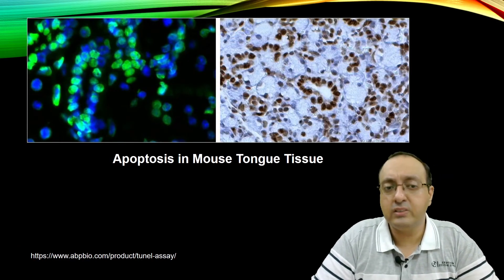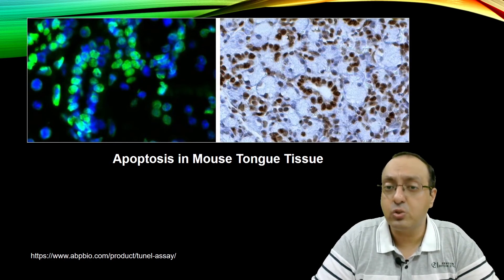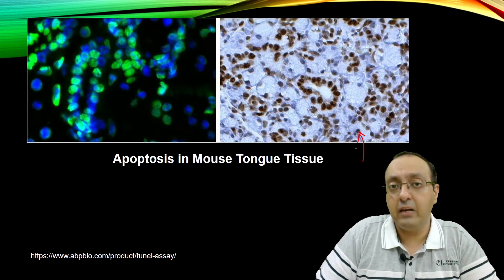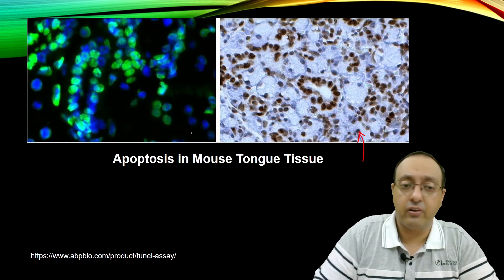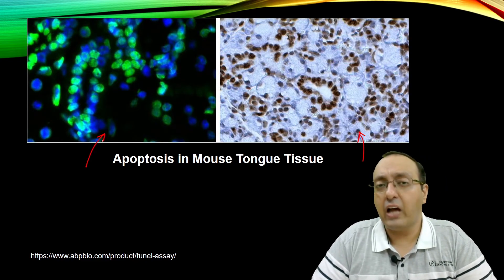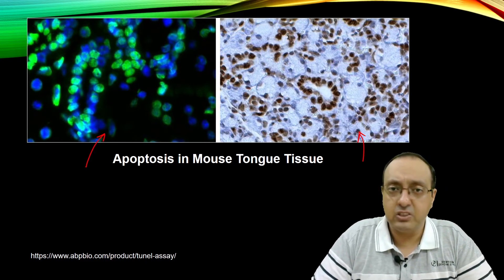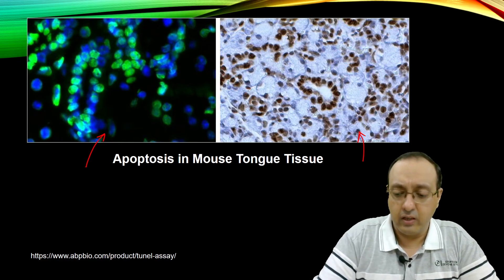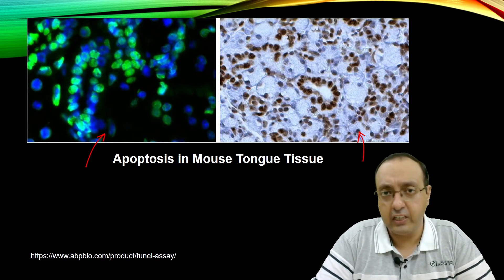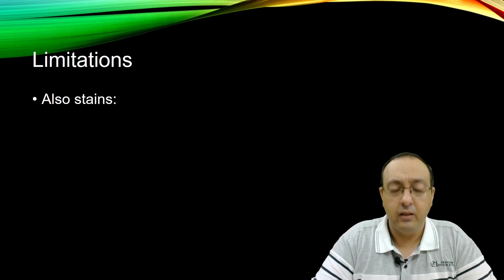Here you can see apoptosis in mouse tongue tissue, shown both in the enzyme-labeled colorimetric reaction as well as the fluorescent reaction. The idea is pretty simple, and you can detect apoptosis both quantitatively and qualitatively.